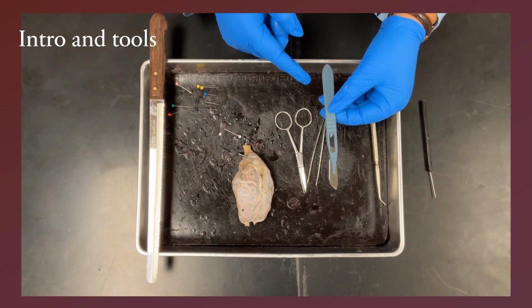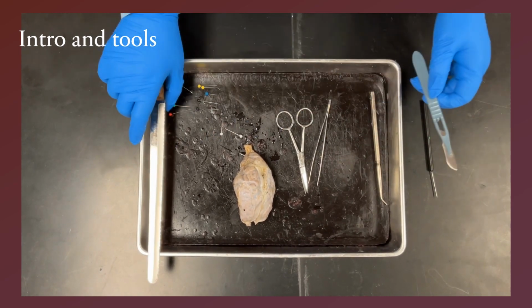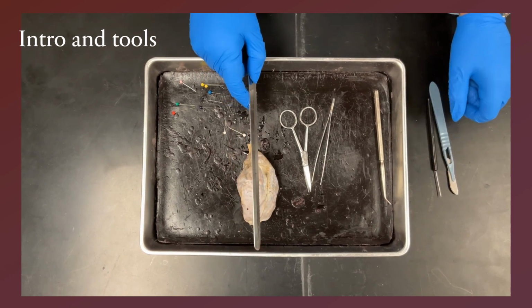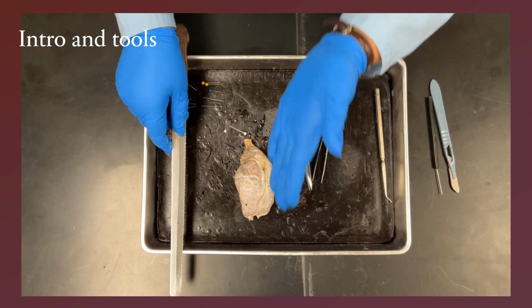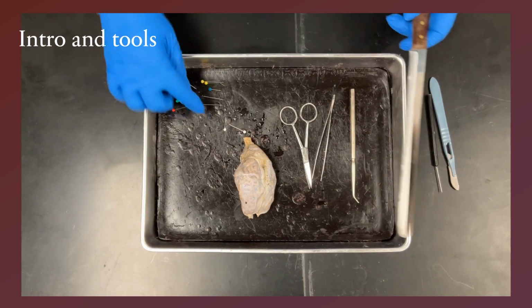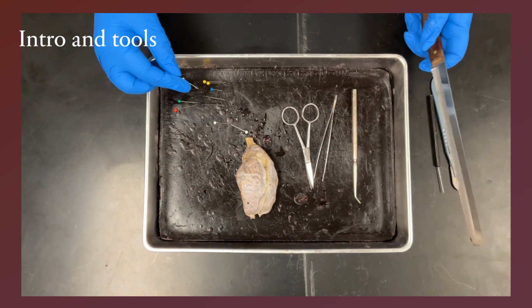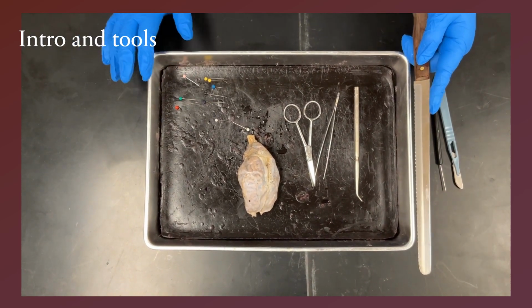And then also the scalpel damages tissue, so we will use a long blade knife to make a neat dissection sagittally. And of course we need the blunt probe, and here I also have some pins. Sometimes those become handy to show the different areas within the structure.